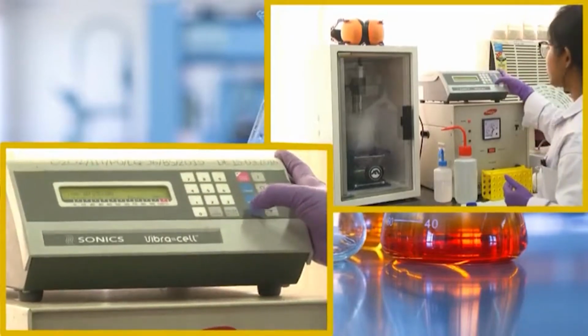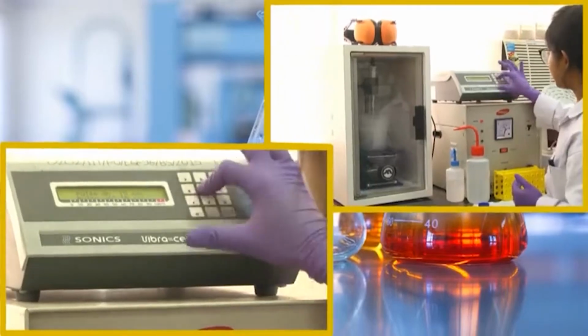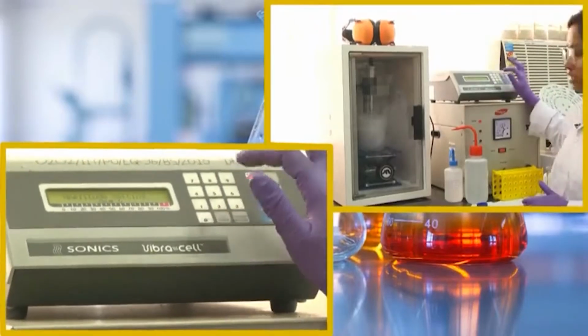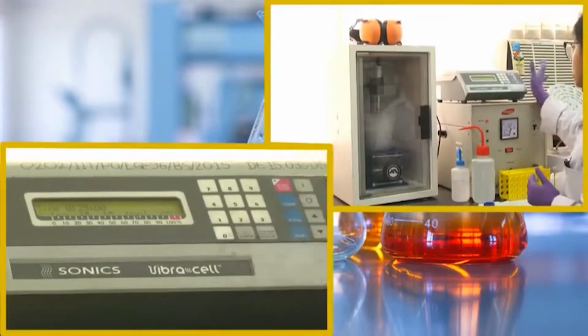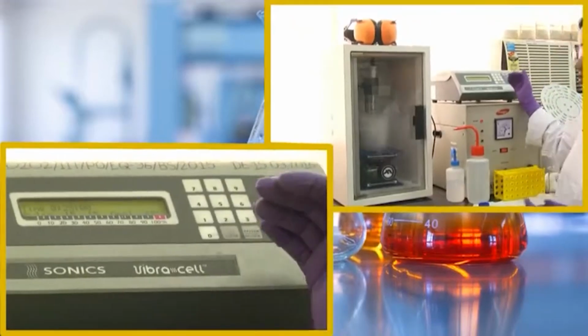Then we go for amplitude. In this machine you can go from 35 to 65% amplitude. It is basically how much vibration it will generate. We will go for the highest one. So, I will start this particular sonication.